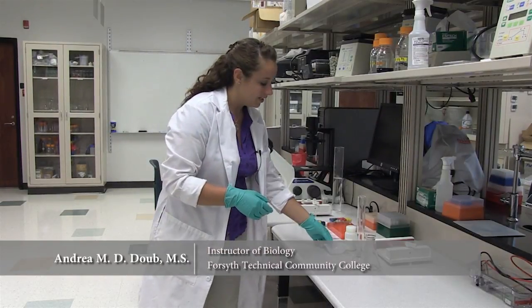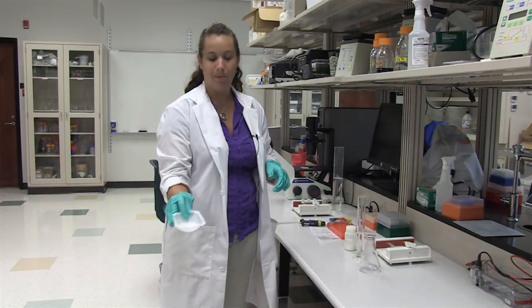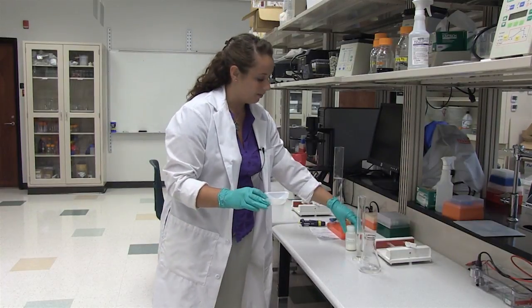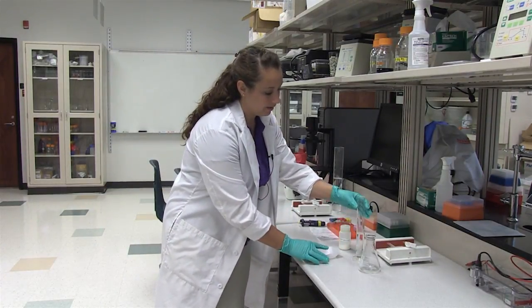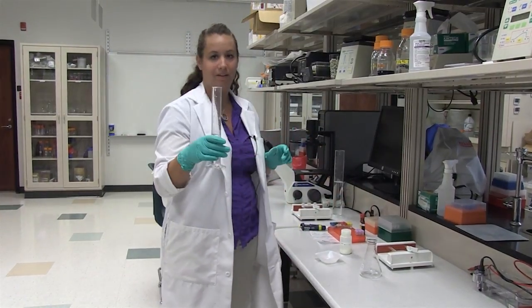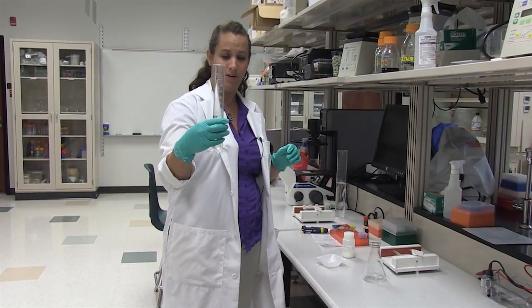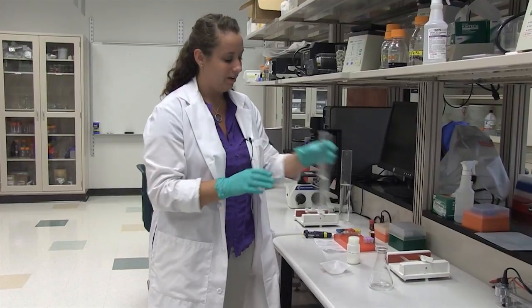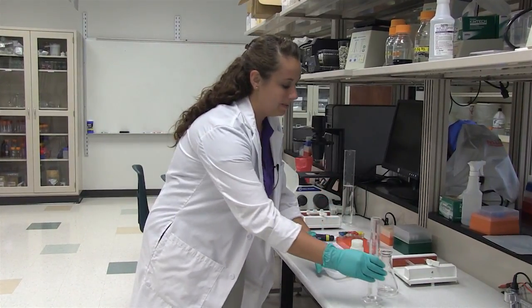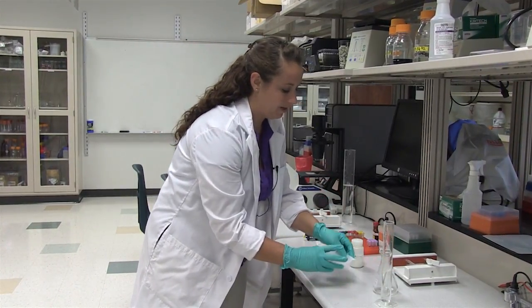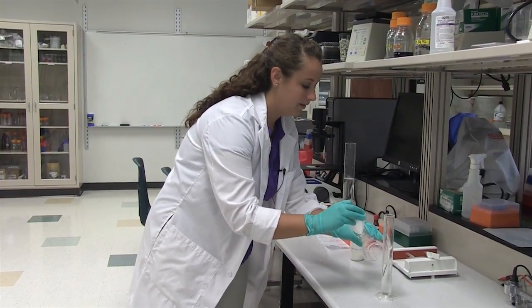So the first thing we need to do is make our 1% agarose gel. We're going to measure 0.4 grams of your pure agarose and we're going to have 40 milliliters of your prepared TAE buffer. We are going to take these and combine them together in a 250 milliliter flask.